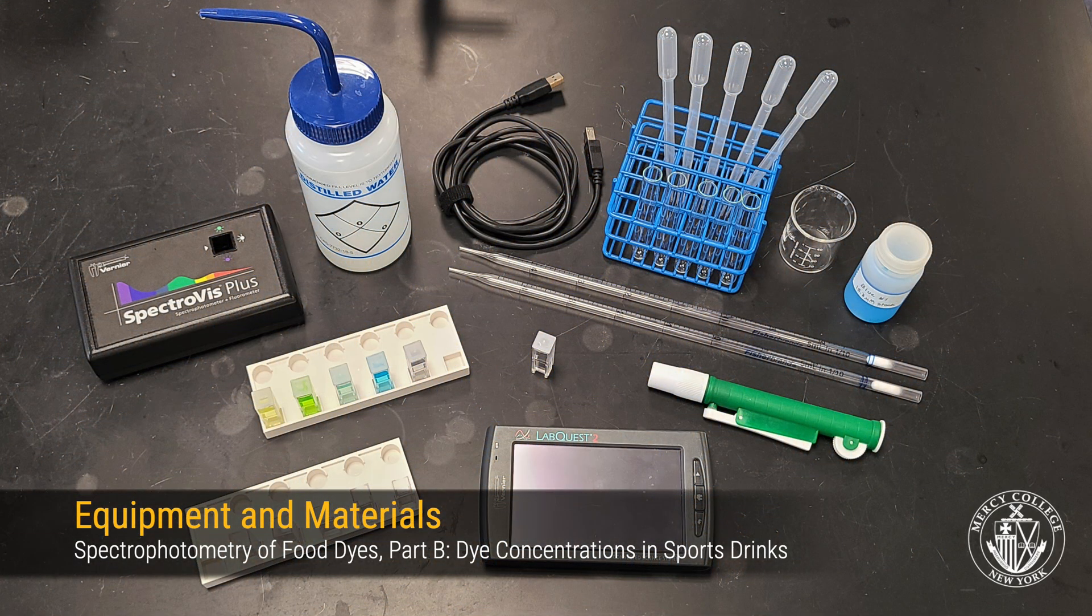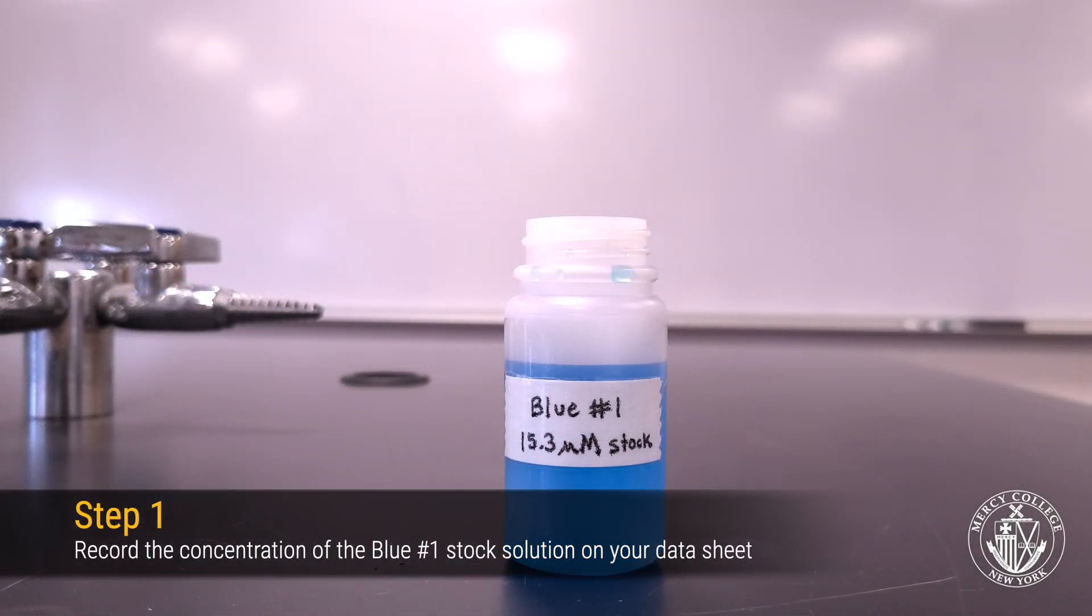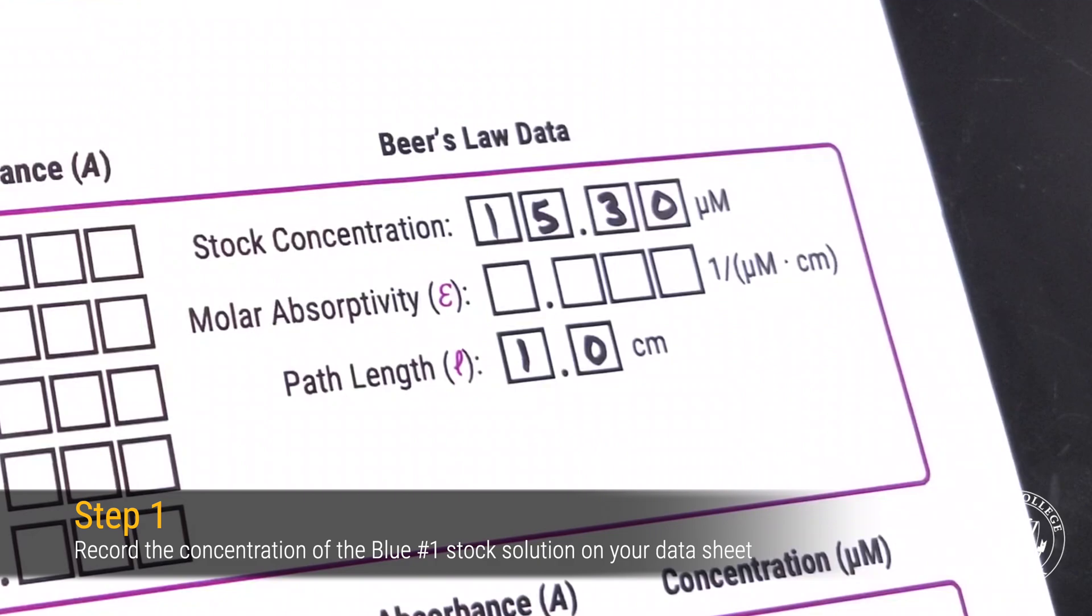Here are some of the materials that we'll make use of in Part B of this experiment. Begin by recording the concentration of your blue 1 stock solution on your datasheet.